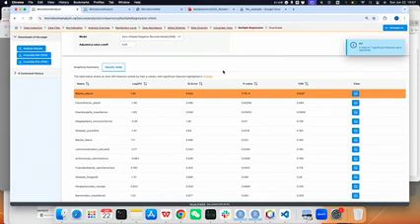I didn't check it because the microbiome data and the metabolomics data in the database were generated in different years. I'm not quite sure if they indeed have a paper like the original database. They have a multi-omics paper, like you can see in the slides when we introduce this data.